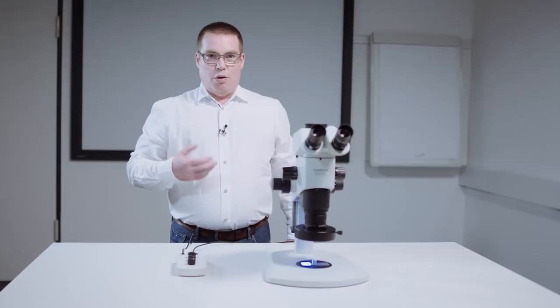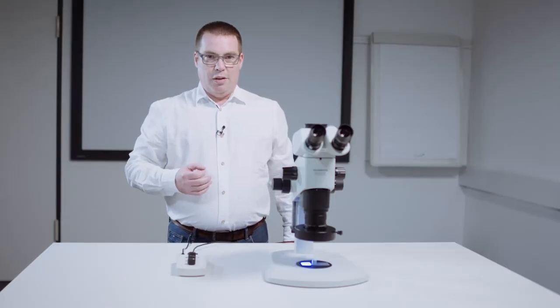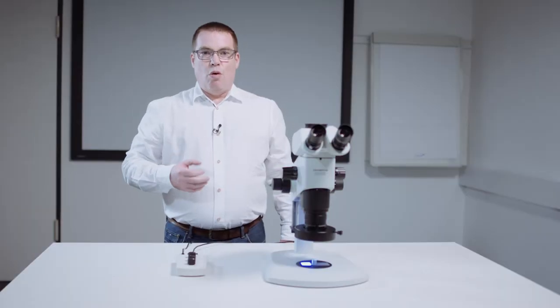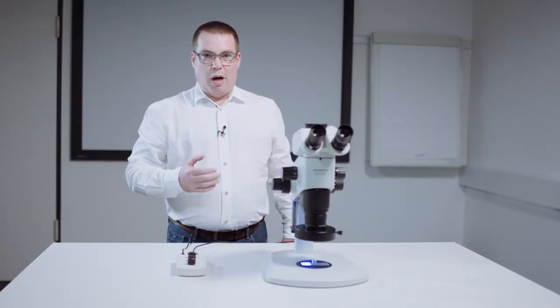Fluorescent markers can be made visible in the paper during document examination, as is shown here on a banknote. Further applications can be found in forensics or in the examination of paints and varnishes, for example.